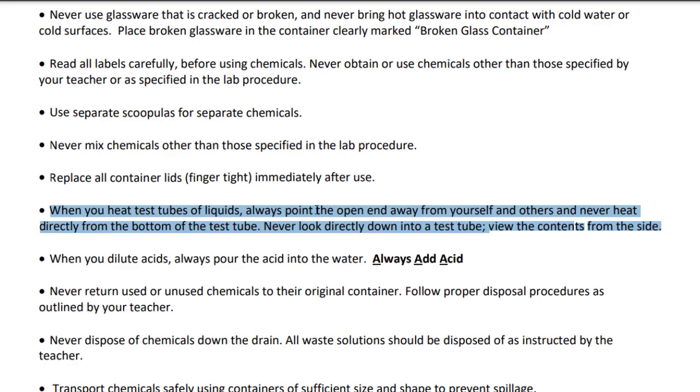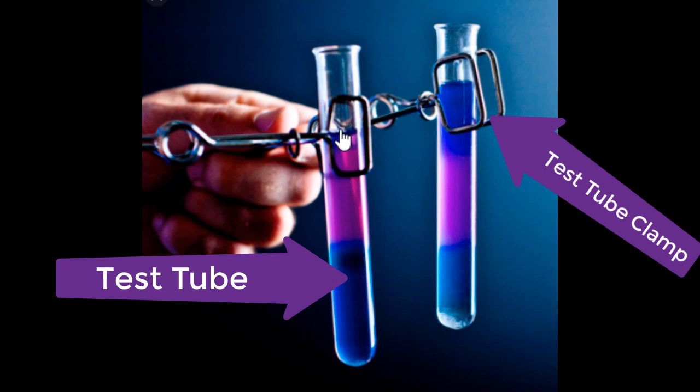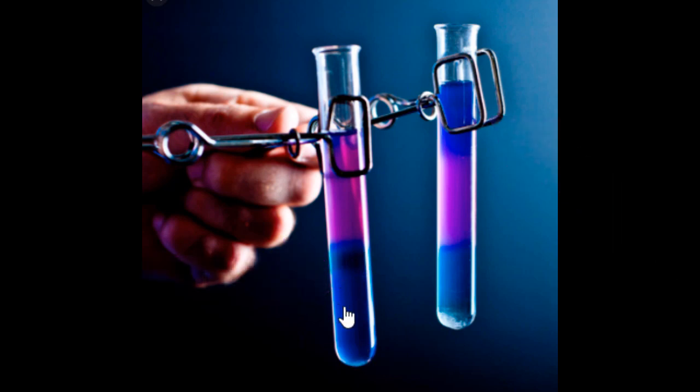I'll show you this again when we get into the lab, but when you heat a test tube, you want to make sure that it's the open end of it. Let me show you a test tube. When you are heating up a test tube and you see something like this here, you don't want to heat it directly from the bottom right here, because if you heat it up from the bottom, there's too much heat for this glass to handle, and you can actually shatter the glass or crack it, and then you have things leaking and unintended consequences, right?